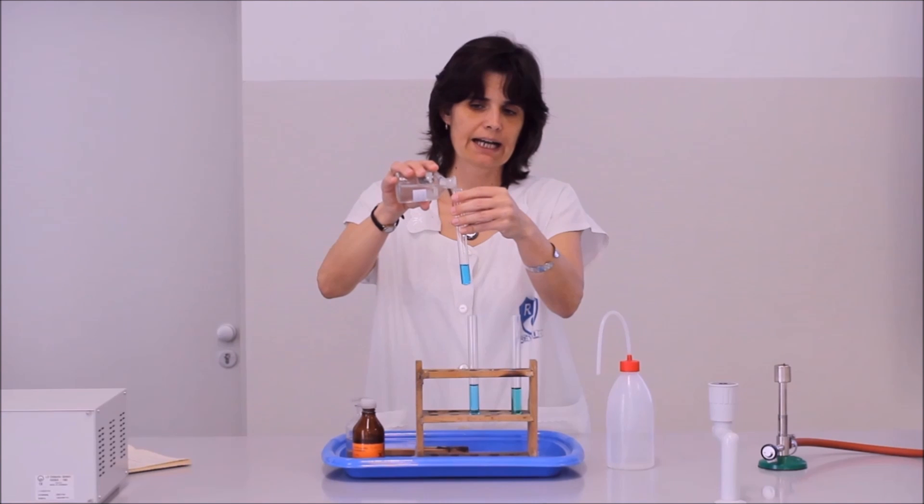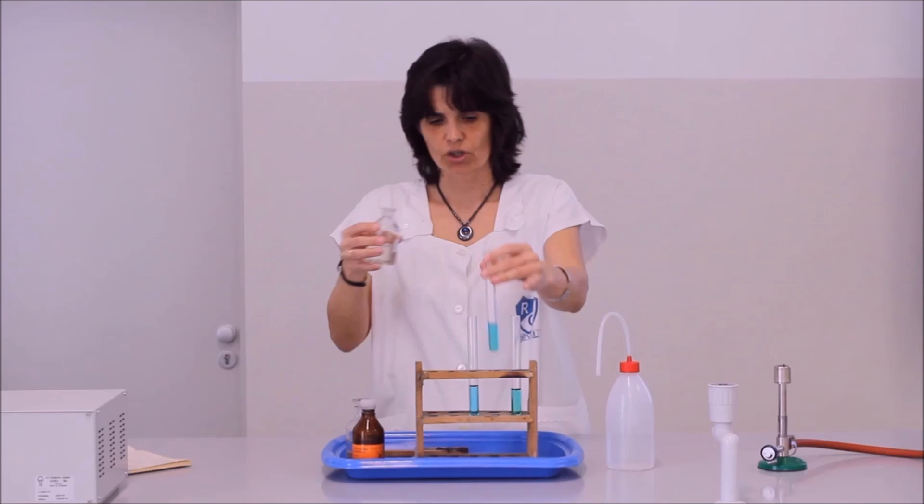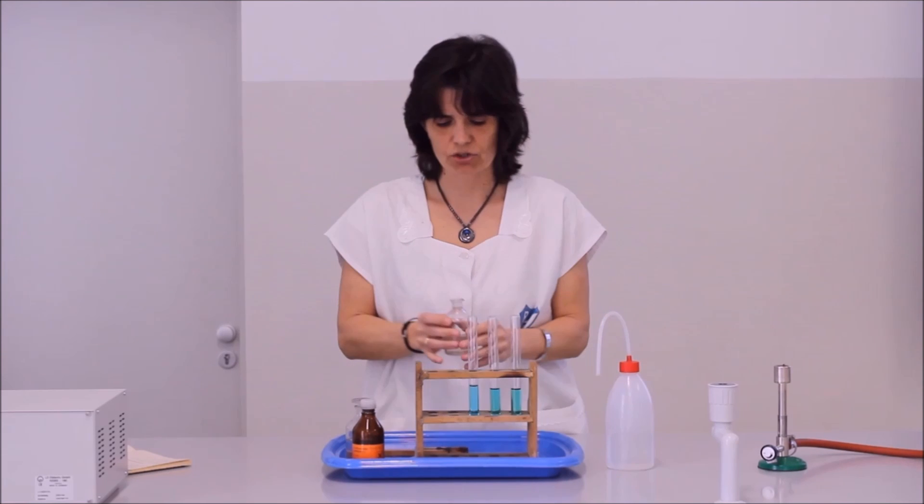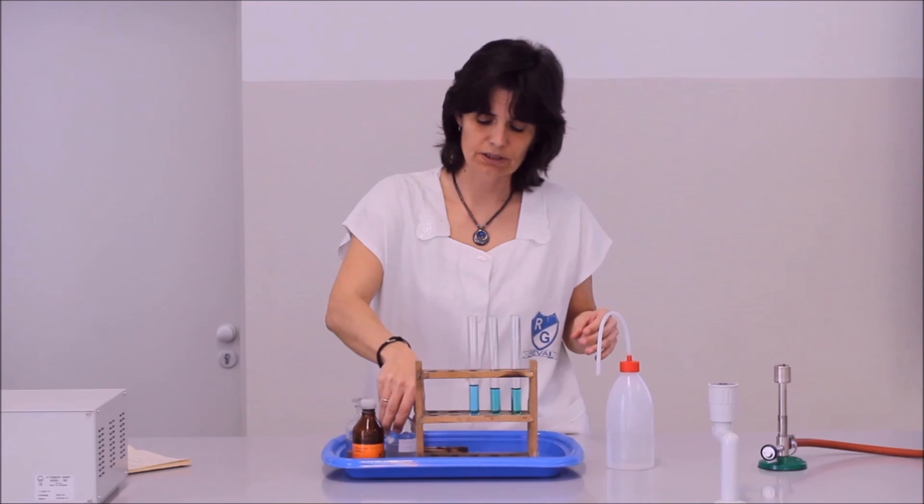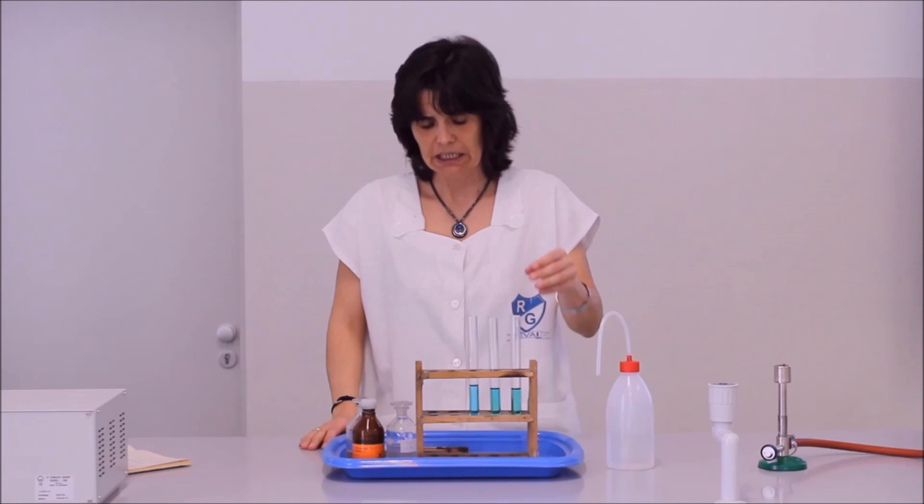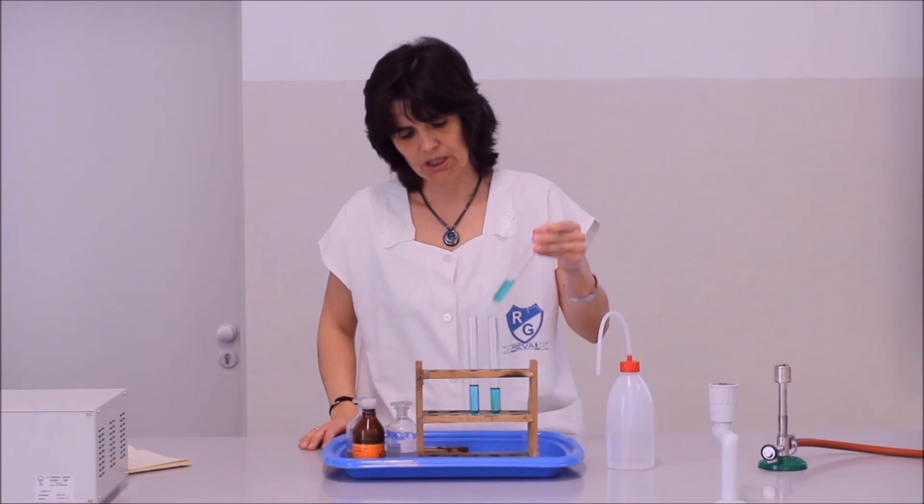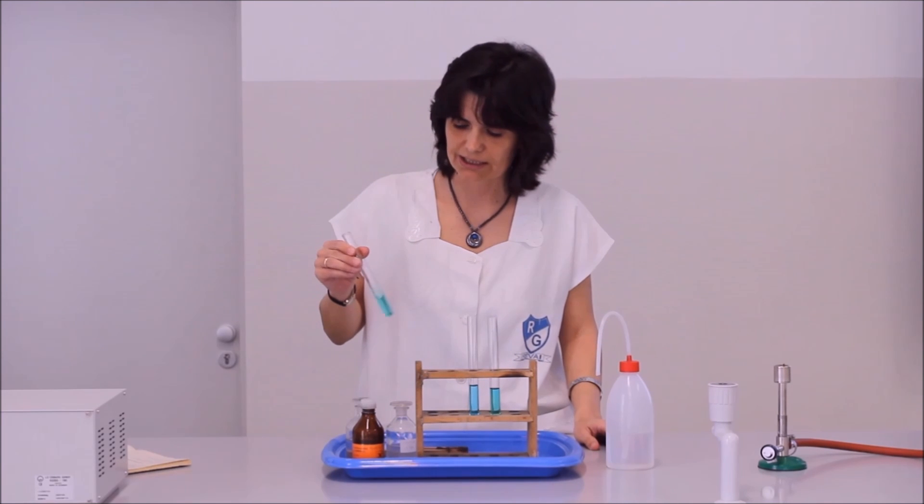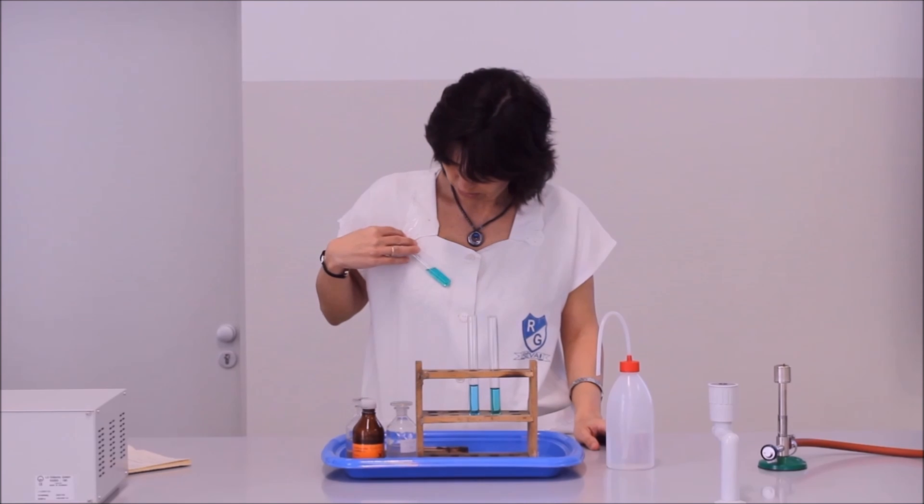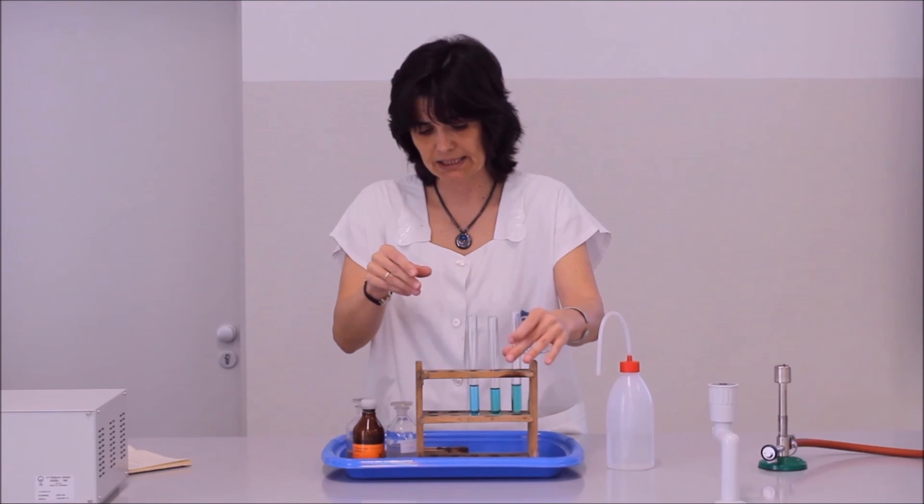Színtelen a káliumbromid oldat, kék színű volt a rézszulfát oldat, és a két anyag egymásra hatásakor réz-tetrabromid komplexion keletkezett. Ennek a komplexionnak a színe zöld, nem tökéletesen, ennél sokkal sötétebb zöld a réz-tetrabromid komplex színe.